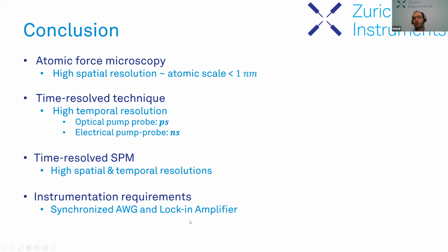The instrumentation required is an AWG and a lock-in amplifier, somehow synchronized together.